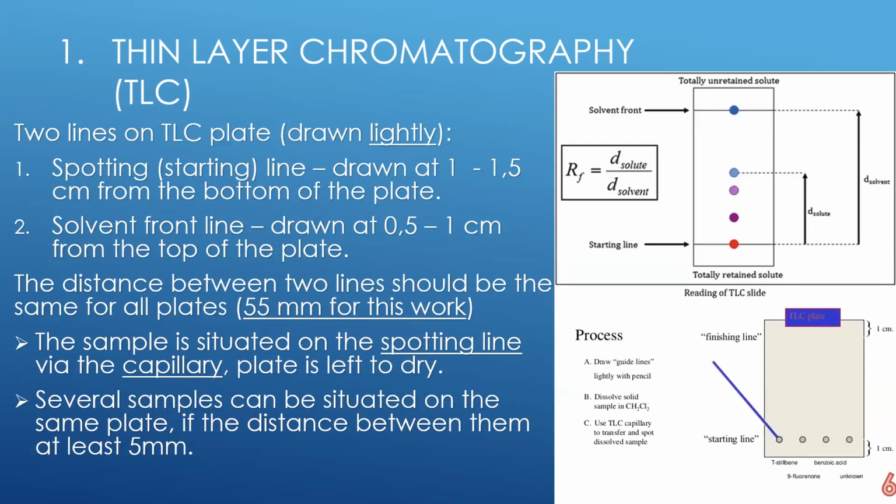Next, we will review how to conduct thin layer chromatography. So, preparation. In this case, we should consider how to prepare the sample and the chromatography plate.